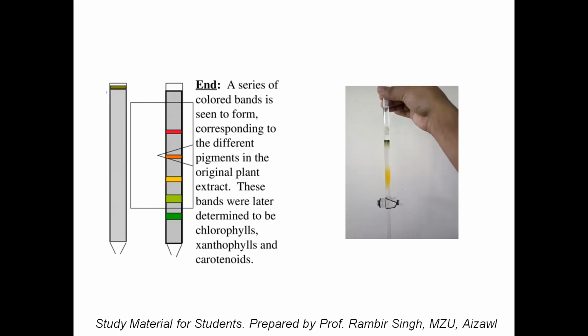So initially, chromatography was used for separation of colored compounds, but later on we started even using it for the separation of colorless compounds. But still the technique is called chromatography because it is used very frequently.